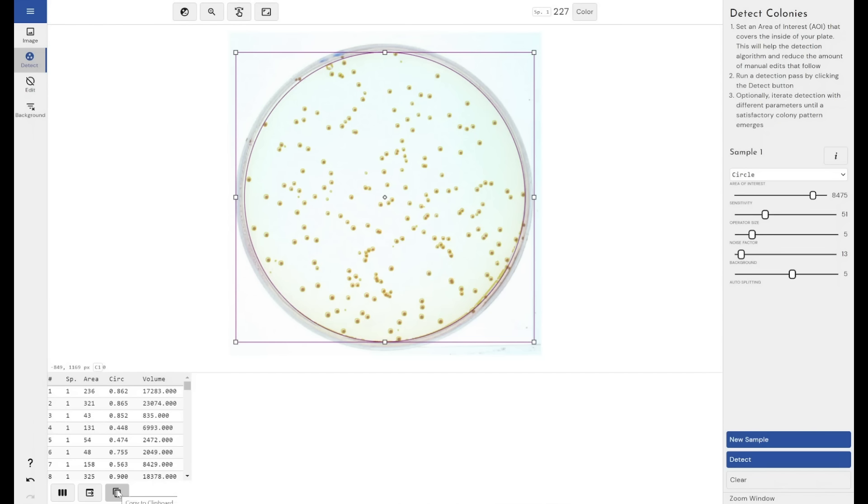Or we can copy this table to our clipboard and paste that wherever it needs to go, MATLAB, anywhere else, somewhere for some processing.